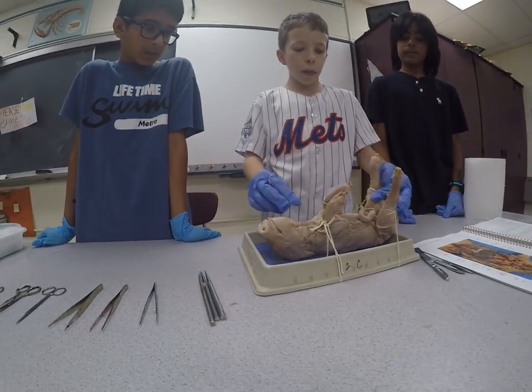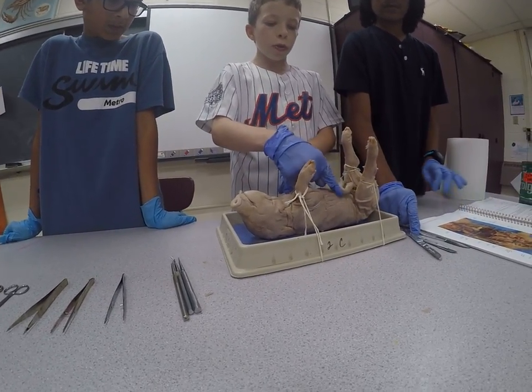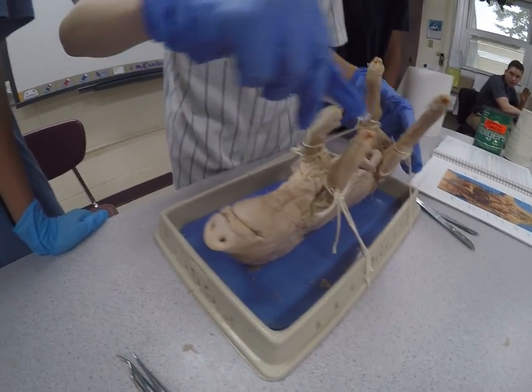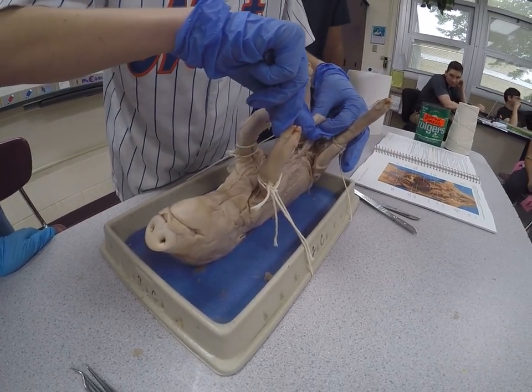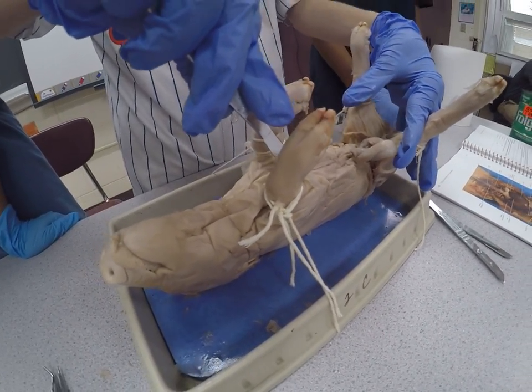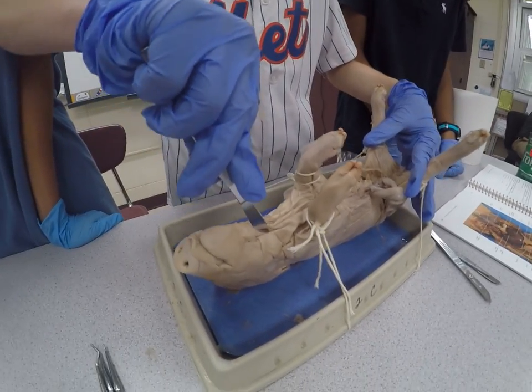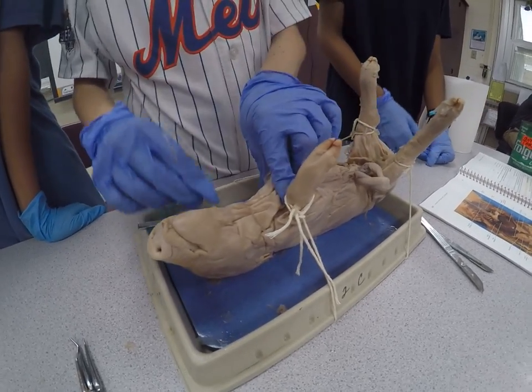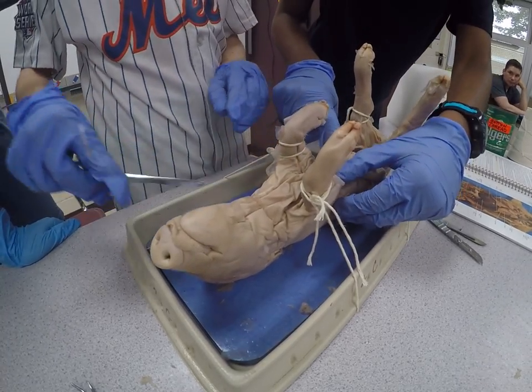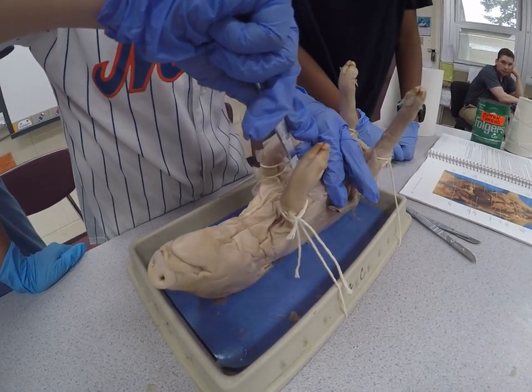We're going to start by cutting from about the top part, which is the larynx, down to about the umbilical cord. I'm just going to make the first incision here. When dissecting — as you guys will learn when you come to seventh grade — you never want to cut beneath the skin layer, because that will cut possibly the internal organs. And because this pig is wrinkly, it'll take a few tries to cut this open.